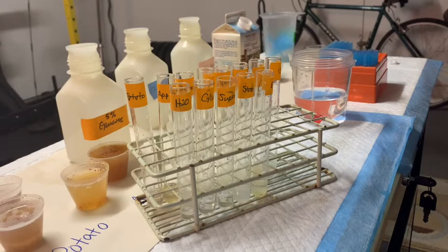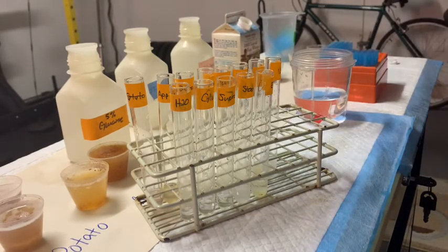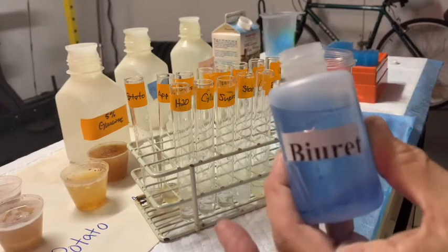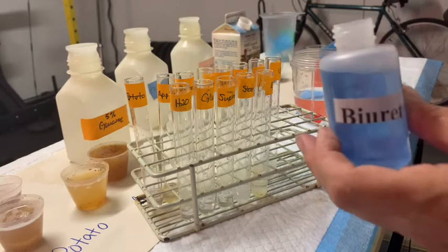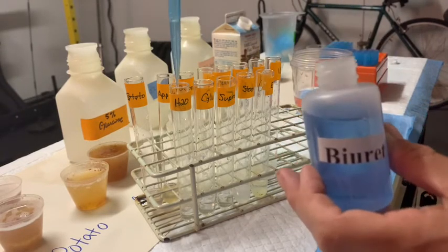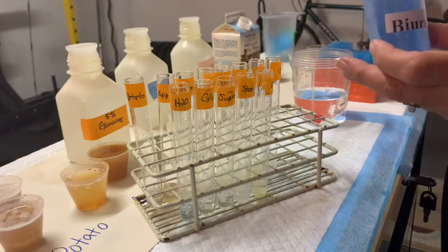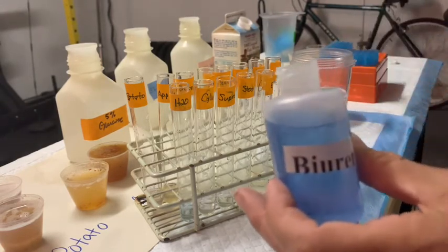The next step is to add the assay reagent — the Biuret reagent right here. It is going to react with the amide groups of amino acids and turn a nice pink to purple color if proteins are present. We're going to add one mil of this reagent to each test tube. Since I'm not touching any of the test tube contents, I'm not going to worry about changing tips. But remember: when in doubt, throw the tip out.